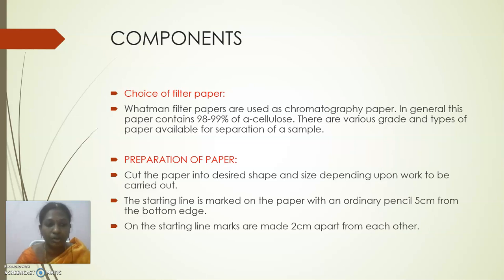So on the line we have drawn, we have to mark a dot that is 2 centimeters apart from each other. And why are we doing that? In the dot we are going to introduce the sample.